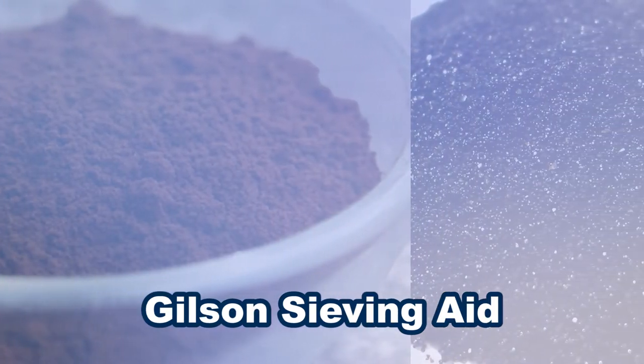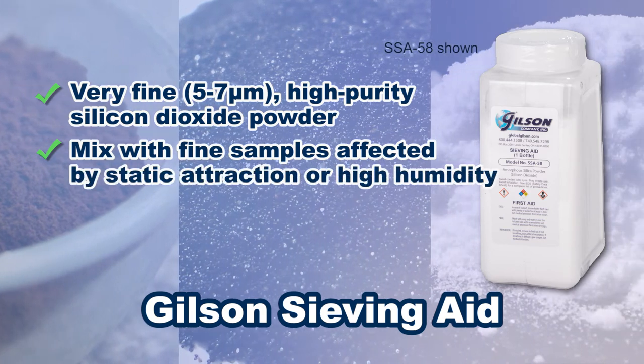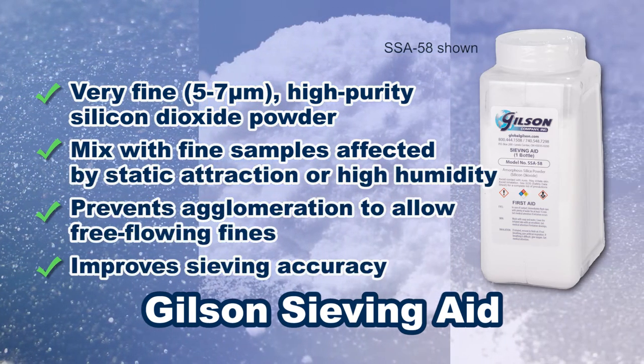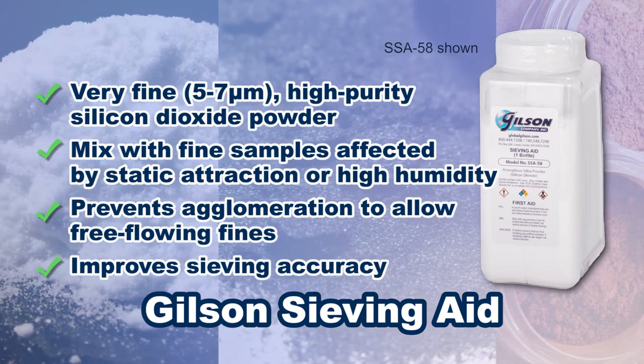Complete your materials testing accessory inventory with sieving aids, a lightweight silicone dioxide powder that is mixed in the specimen to help prevent problems with static charges and humidity.